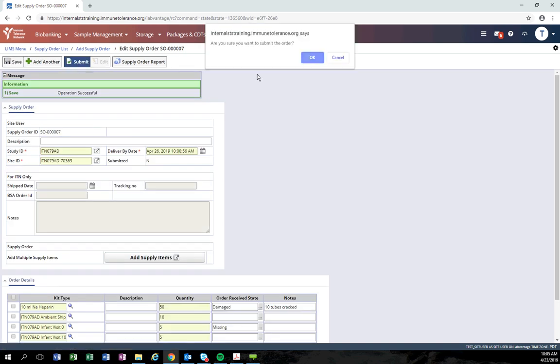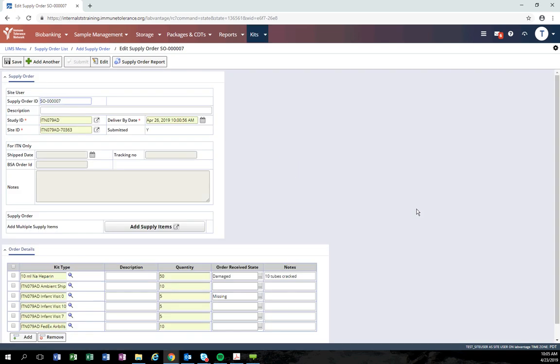Resubmit that order and the email notification will be received at the ITN to note any issues with your order. We'll then work with the vendor to resupply you with any damaged or missing items.